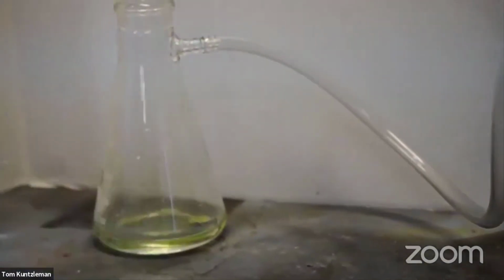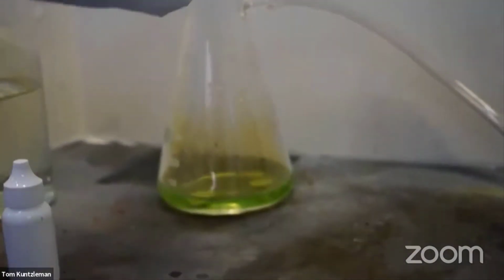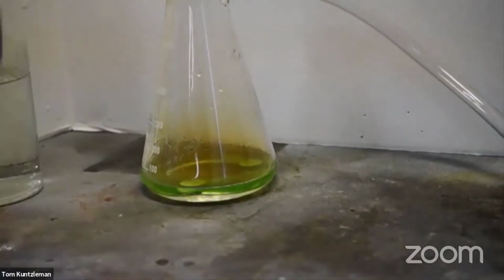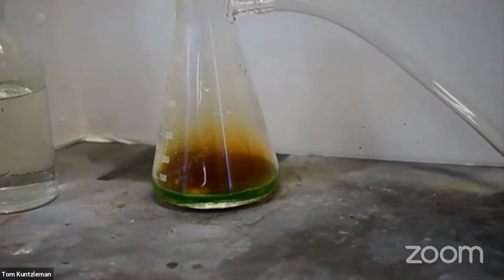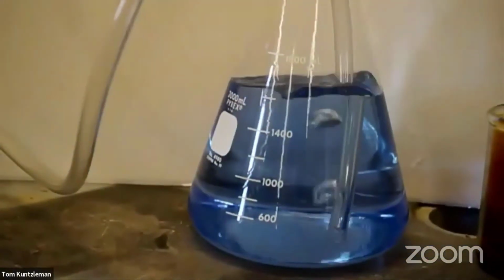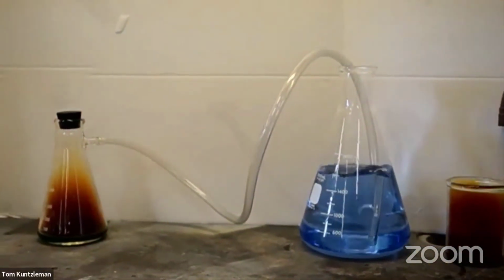Add the lid. Let's roll here. Get that stoppered off. See what happens. Oh, look, it's bubbling over there. Sure is. We know the gas bubbles are going through. Same thing going.